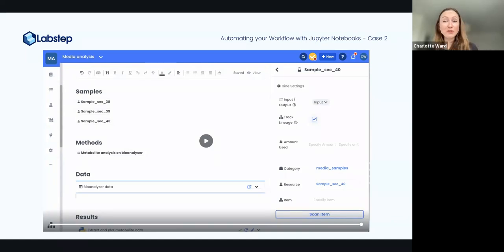Yeah. What's also very useful is you don't have to download any of these things. Because it's all cloud-based, normally if you're doing some kind of scripting on your computer, libraries like that you'd have to download. These things are all doable, but when you're first starting out and you just want to get in and do some scripting, it's an awful lot of setup overhead. You don't have any of that there. You can straight away import them and start using them.